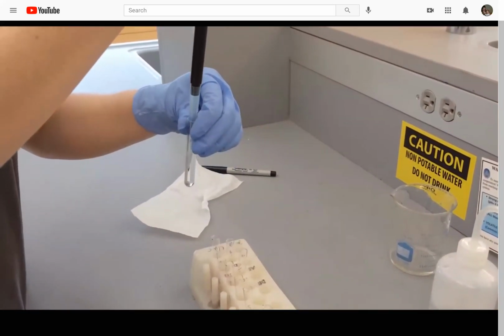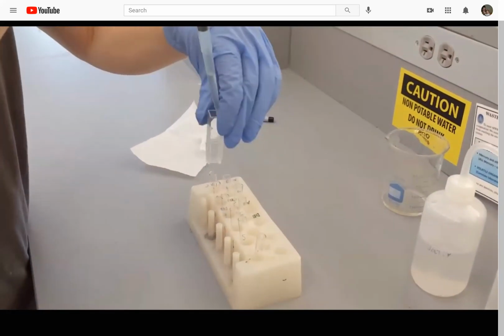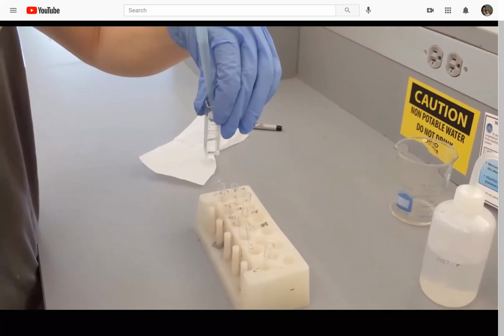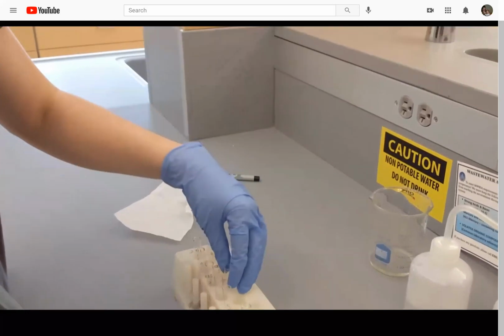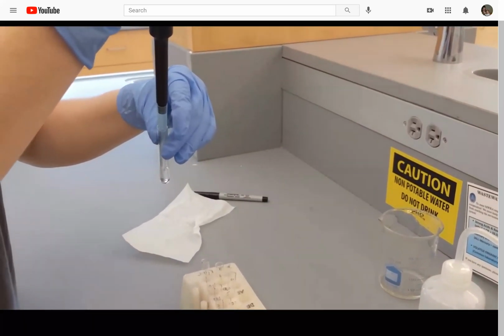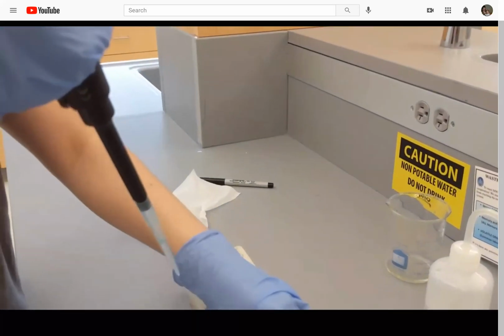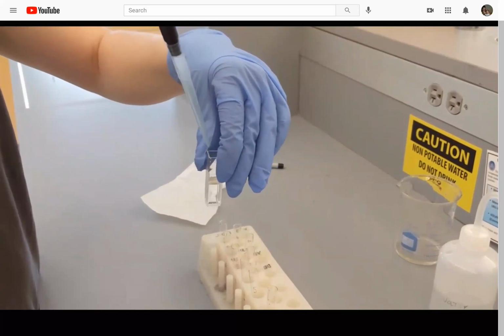I'm going to take enough solution out of here and place it in my cuvette. And I do have a few water droplets in my cuvette, which will dilute it slightly further. So that would be a source of error. Realistically, you would want to start with a dry, clean cuvette.